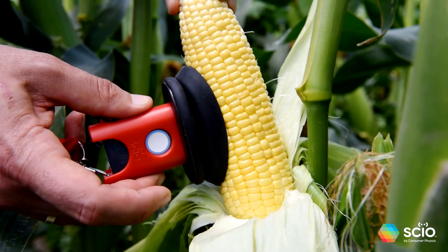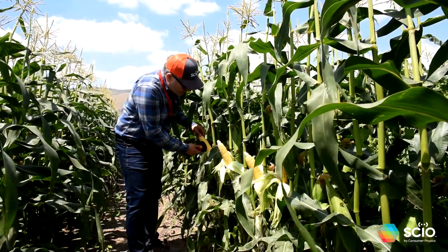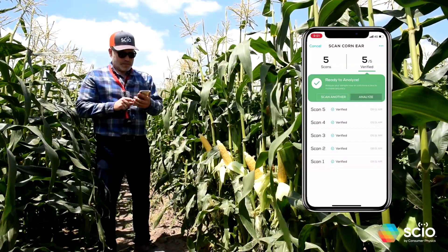Click the button, wait for approval, and move on to the next cob. Repeat this step until you are done scanning five cobs, and hit the Analyze button to get the moisture results for this field location.